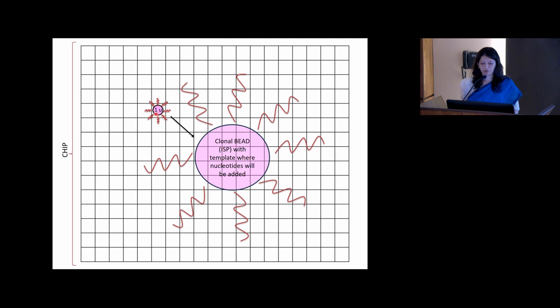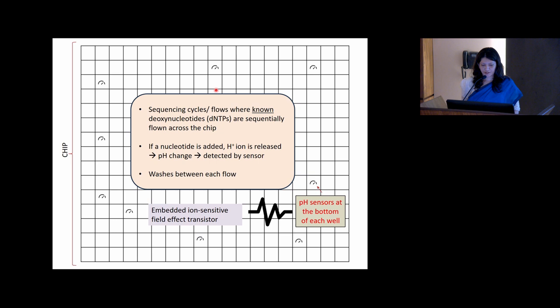When we zoom into the bead, the bead will have these templates which are mostly clonal. Clonal means, suppose there is a sequence called ACTG, all of them are supposed to have that same sequence. So this is a clonal bead. When a T gets added here, numerous T's will get added, so that the pH change is detectable by the sensor. That is why this clonal template generation is necessary.